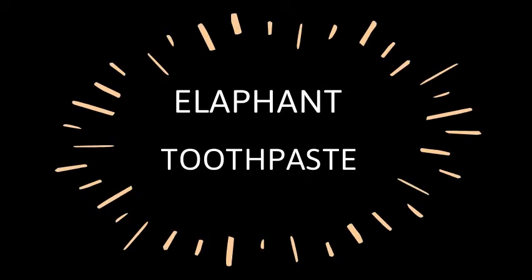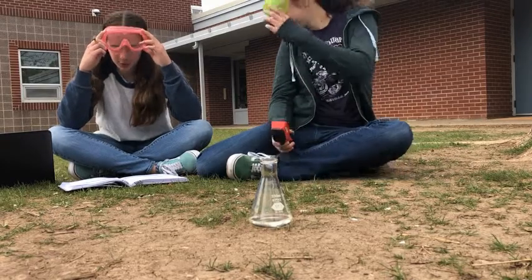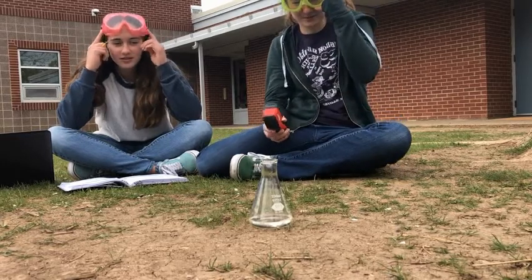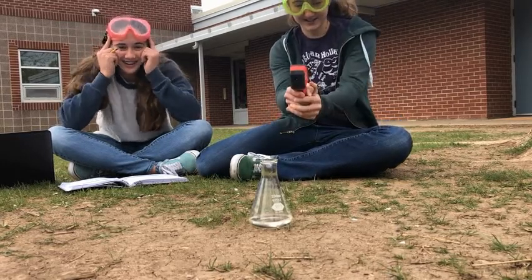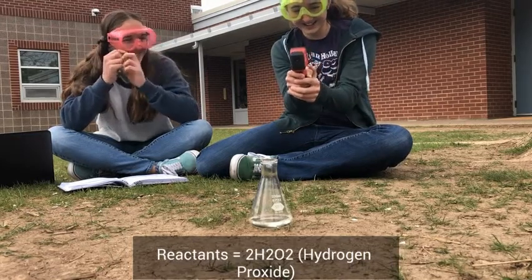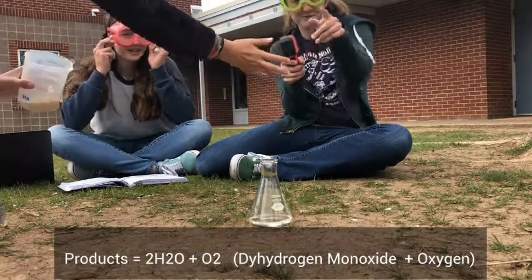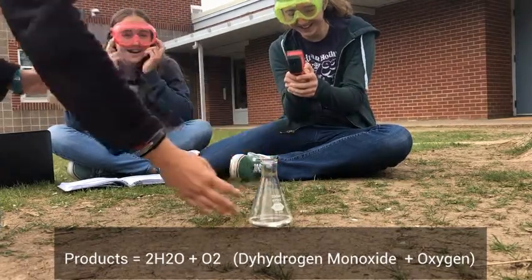In the elephant toothpaste experiment, we combined hydrogen peroxide and dish soap. We also combined water and yeast. We then combined both of the solutions. The reactants for this experiment were hydrogen peroxide, aka 2H2O2. The products were 2H2O plus O2, which is dihydrogen monoxide and oxygen.